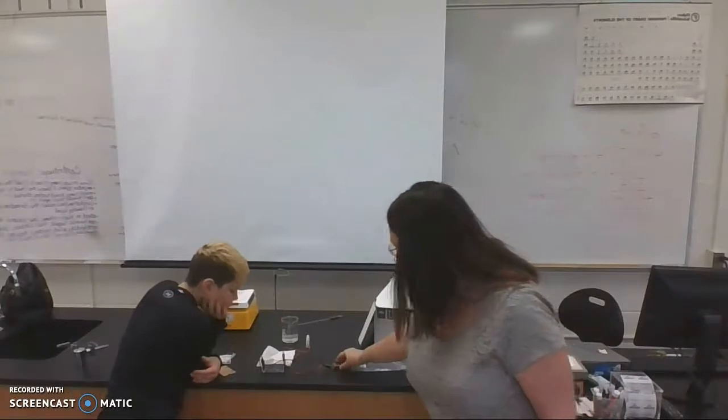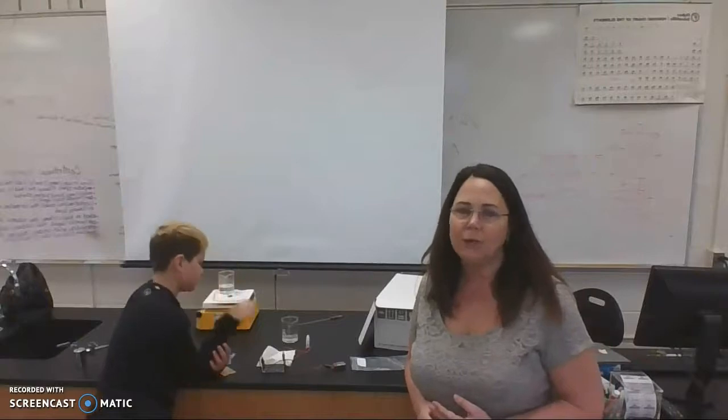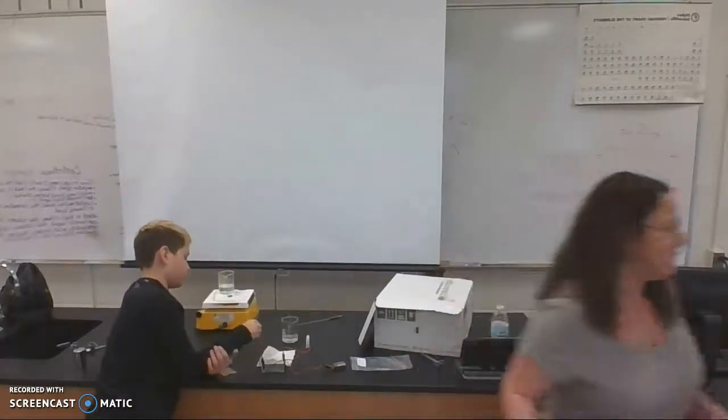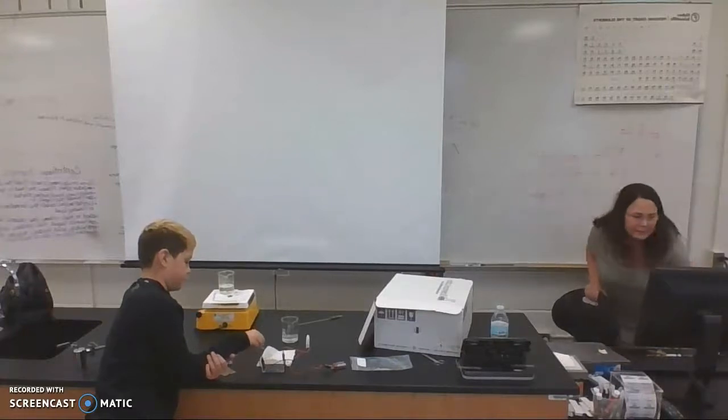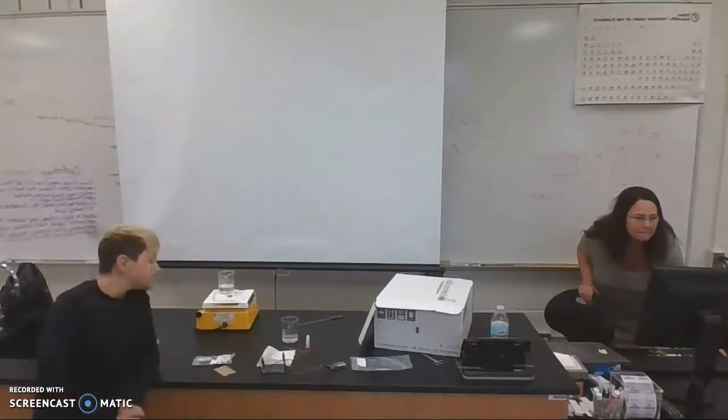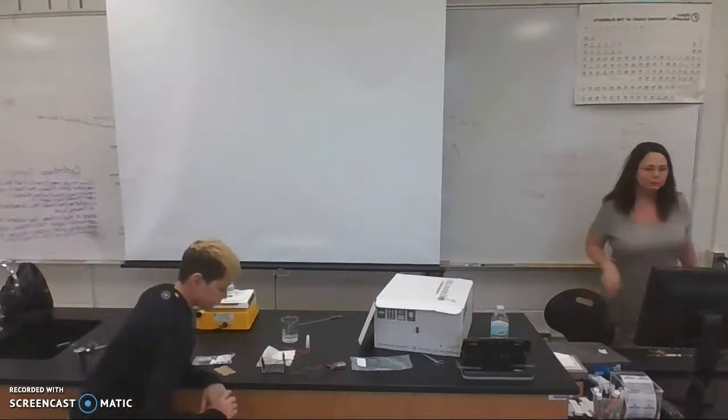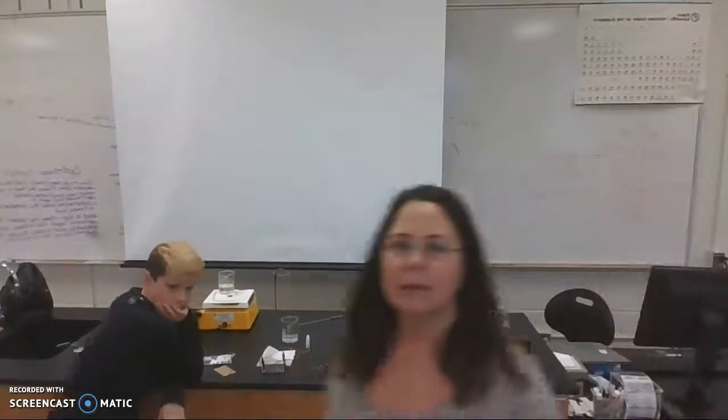Now that you've got it set up and hooked to the battery, you will let the dye run for as long as it takes. Let me check the instructions. For an hour, so we'll pause here.